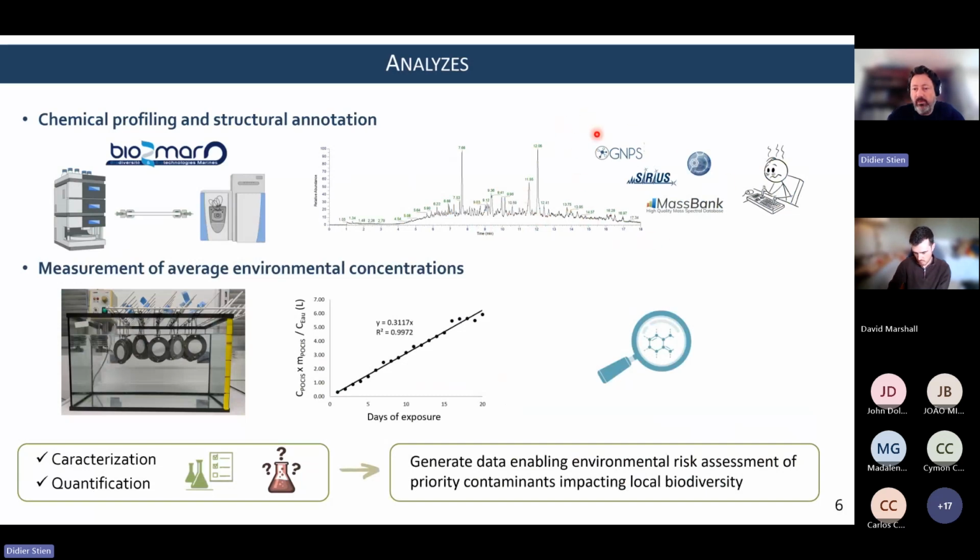We use some automatic analysis, but it doesn't work very well, and there is a lot of brain juice that we have to put in this analysis, and we do a lot of manual annotation of the different chemicals. This is something that we do well in our group, but we are trying to use this experience that we have to develop different things, and I'll show you later.